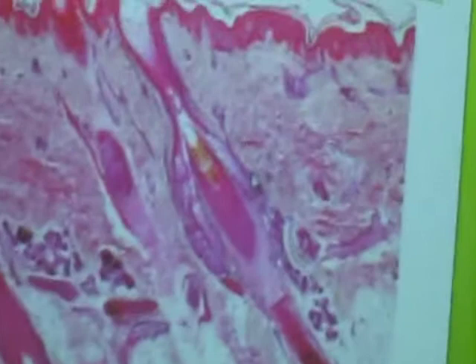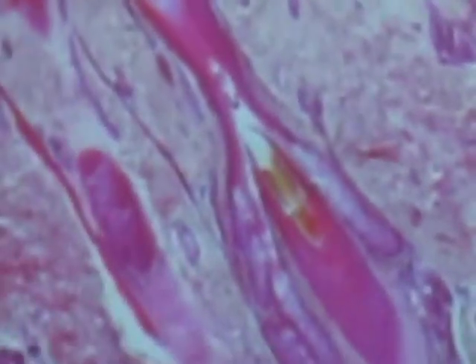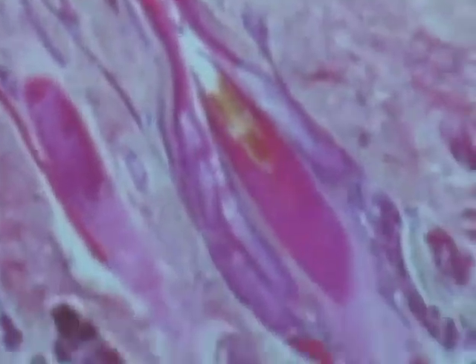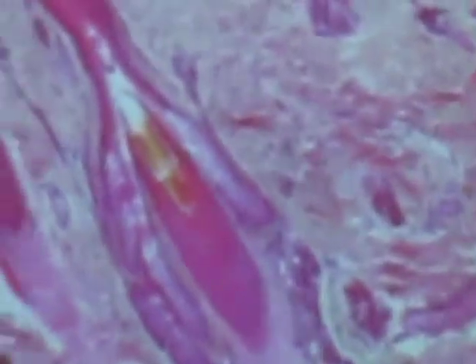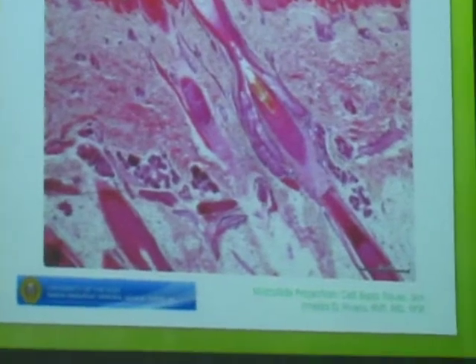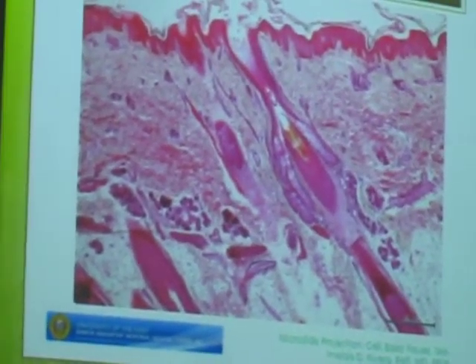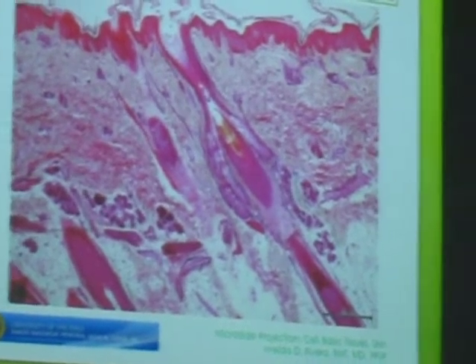Mucinous. So you have how many questions just for the sebaceous? Identify, classify according to morphology, according to secretion, according to gland cell participation. 4 questions agad.